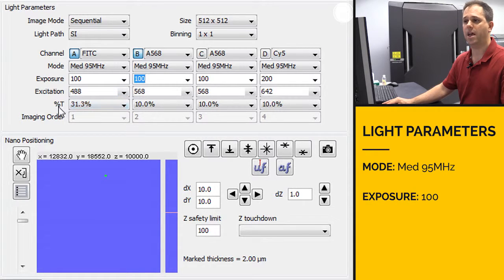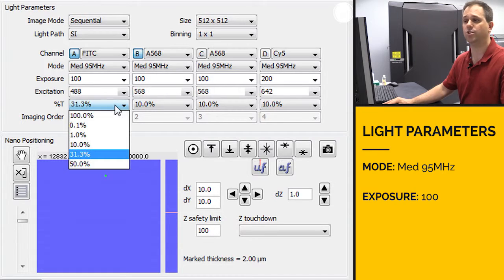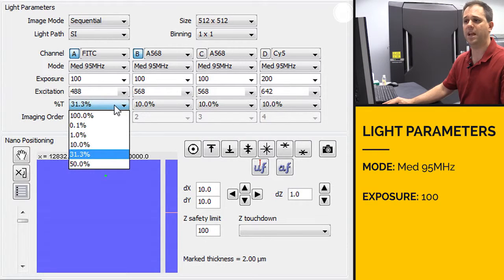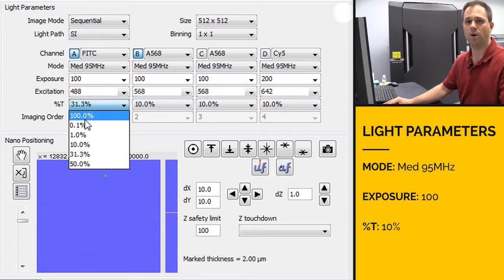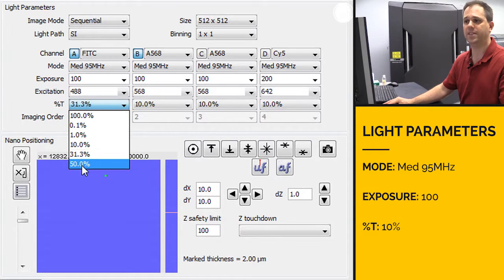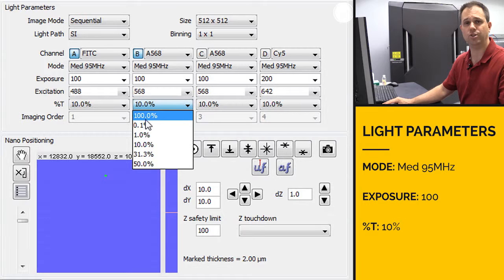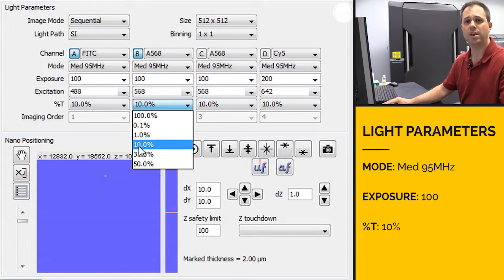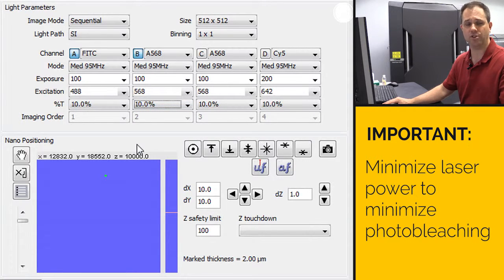And then for your laser power percentage, your transmission percentage, we want to set that to around 10%. You have choices from 0.1% to 100%. We want to set that at 10%. One thing to pay very close attention to on the OMX is to make sure that you minimize the amount of laser power that you use.